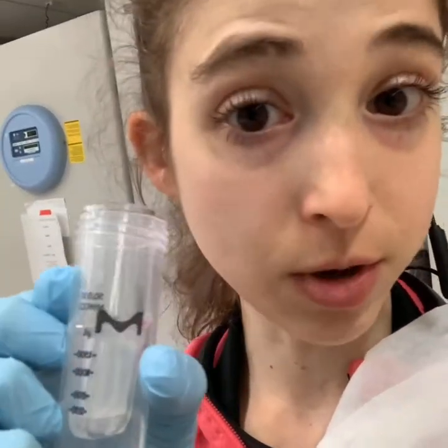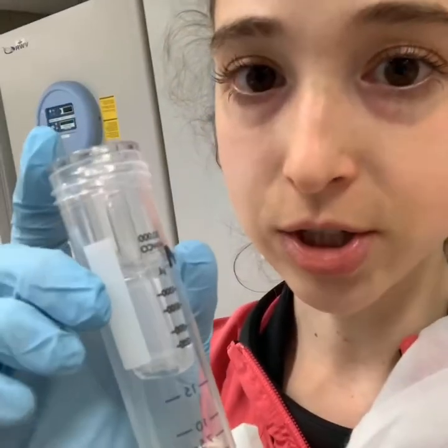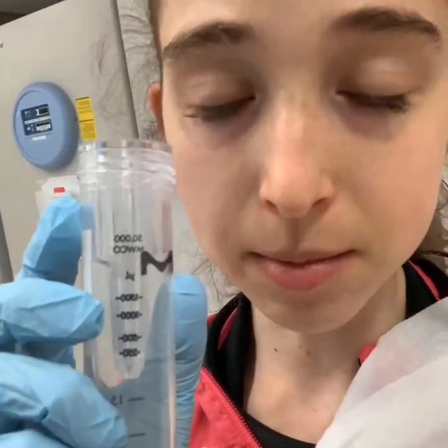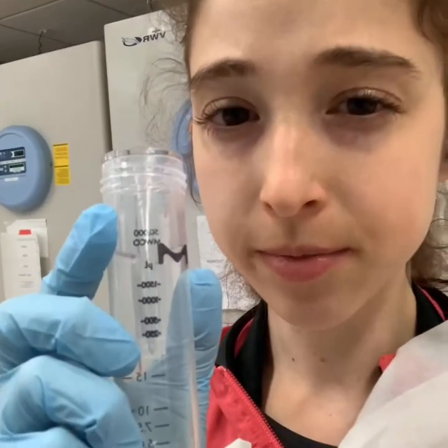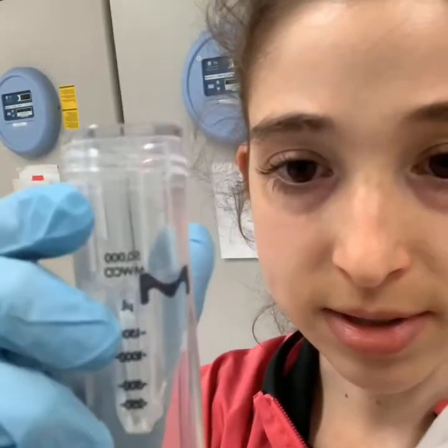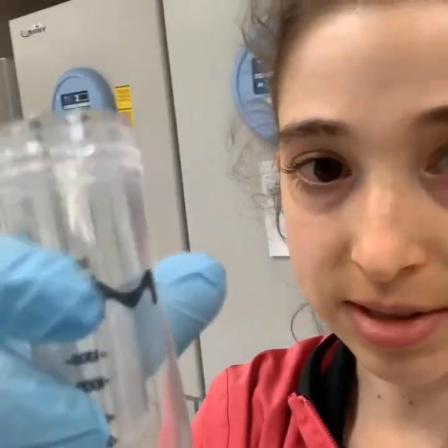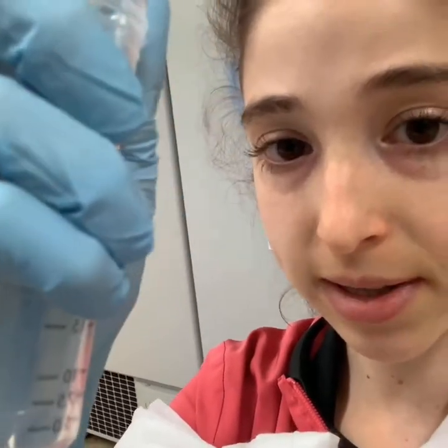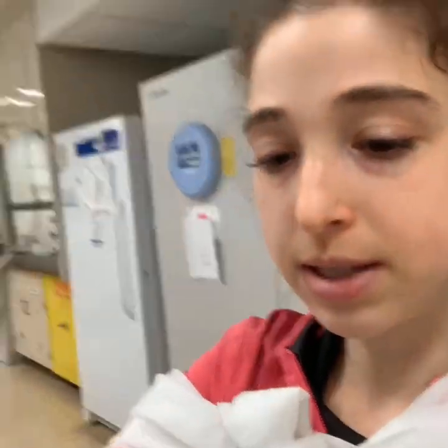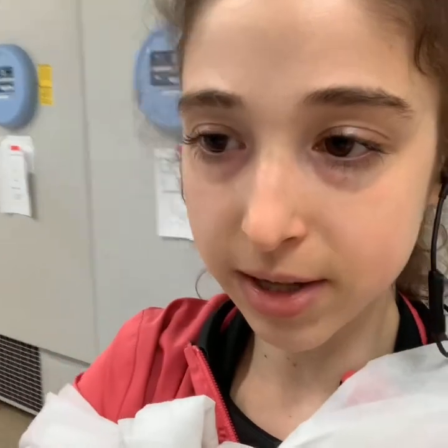Especially if you've never worked with this protein before, make sure you monitor it while you're going and don't concentrate it too far. Your protein gets concentrated down and then you take a pipette and suck out the liquid — your concentrated protein should be in the cup part. That's how these guys work.